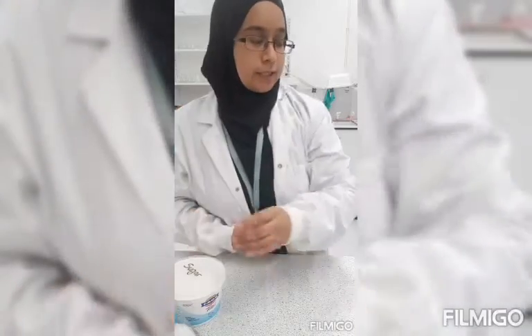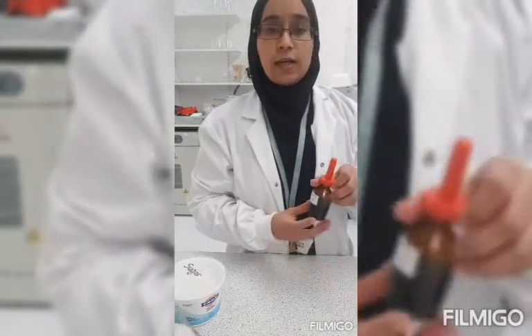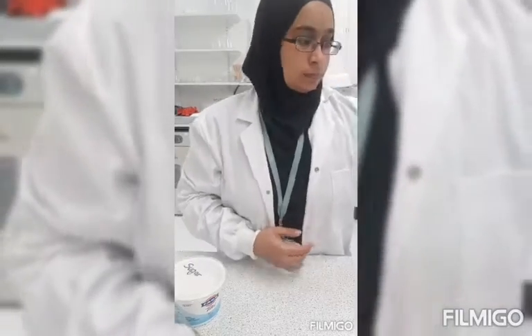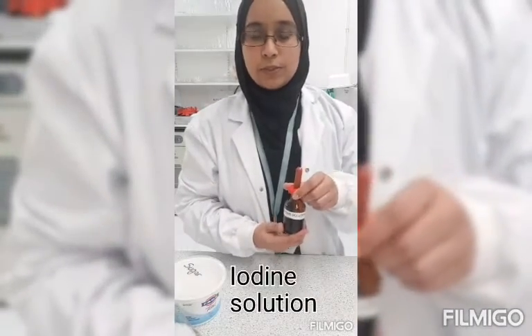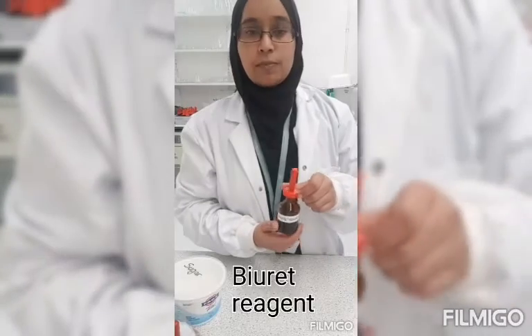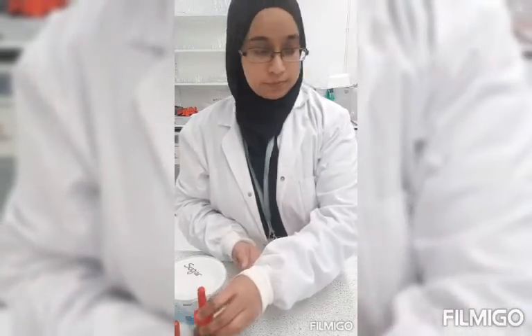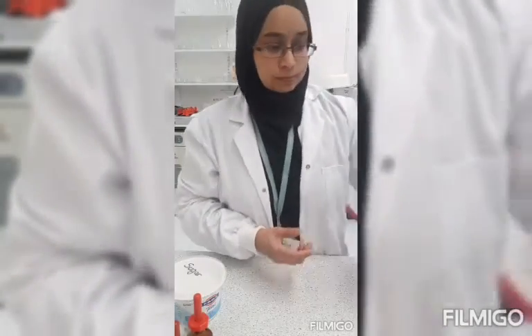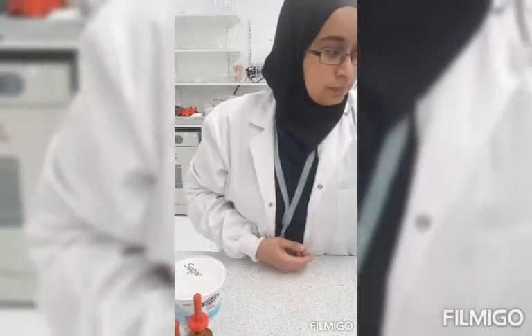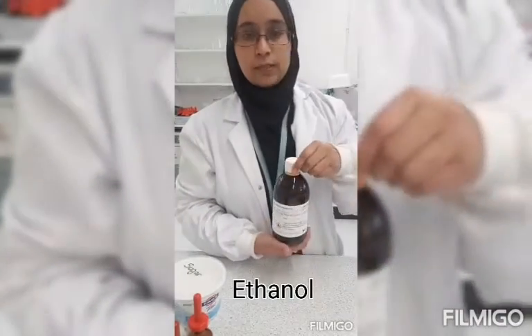You'll also need some solutions to test the food with. I have Benedict solution, iodine solution, biuret reagent, Sudan III solution, and ethanol.